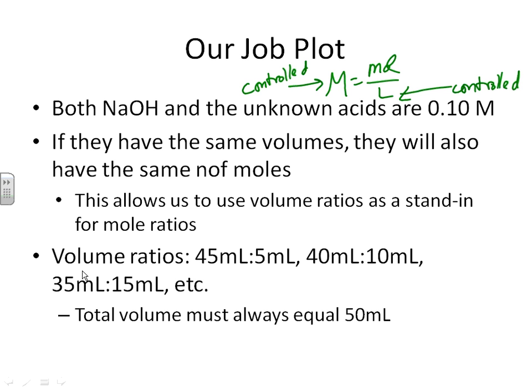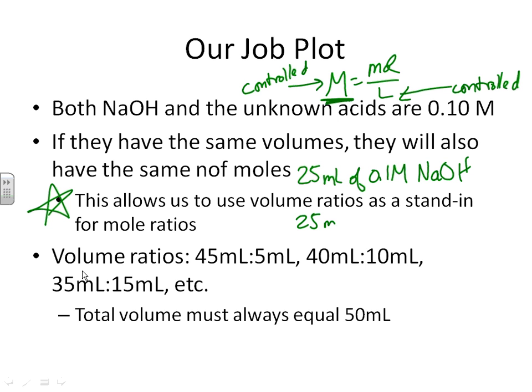which is why right here we can make this statement: because the molarities are the same, the volume ratios being used are actually being used as a stand-in for the mole ratios. So when we look at the second bullet point right here, if your two solutions have the same volume, they must also have the same number of moles, right? If you have 25 milliliters of 0.1 molar NaOH and 25 milliliters of 0.1 molar unknown acid.